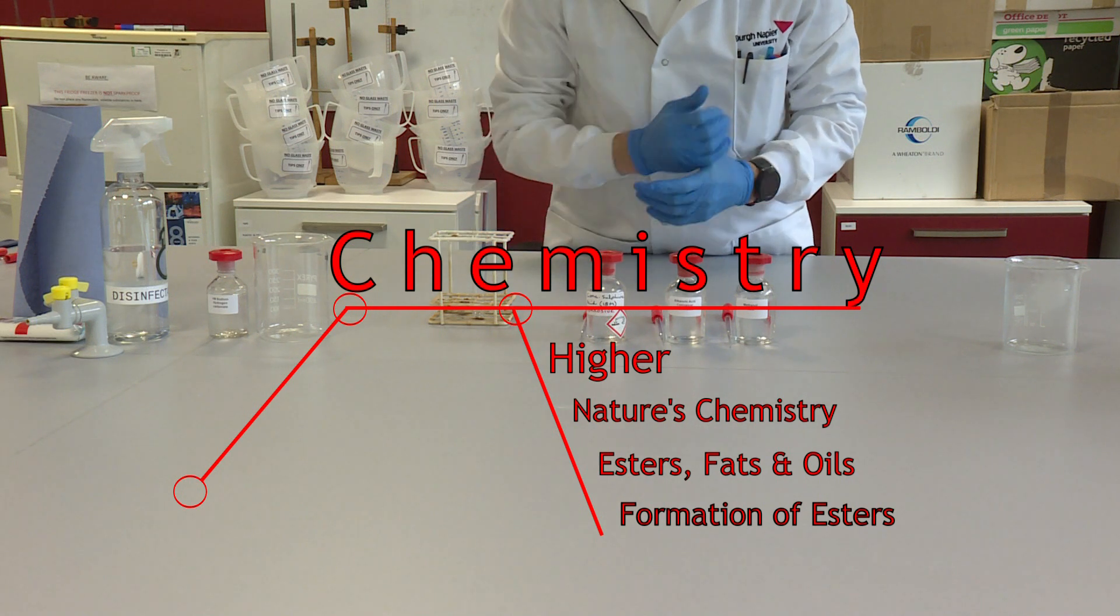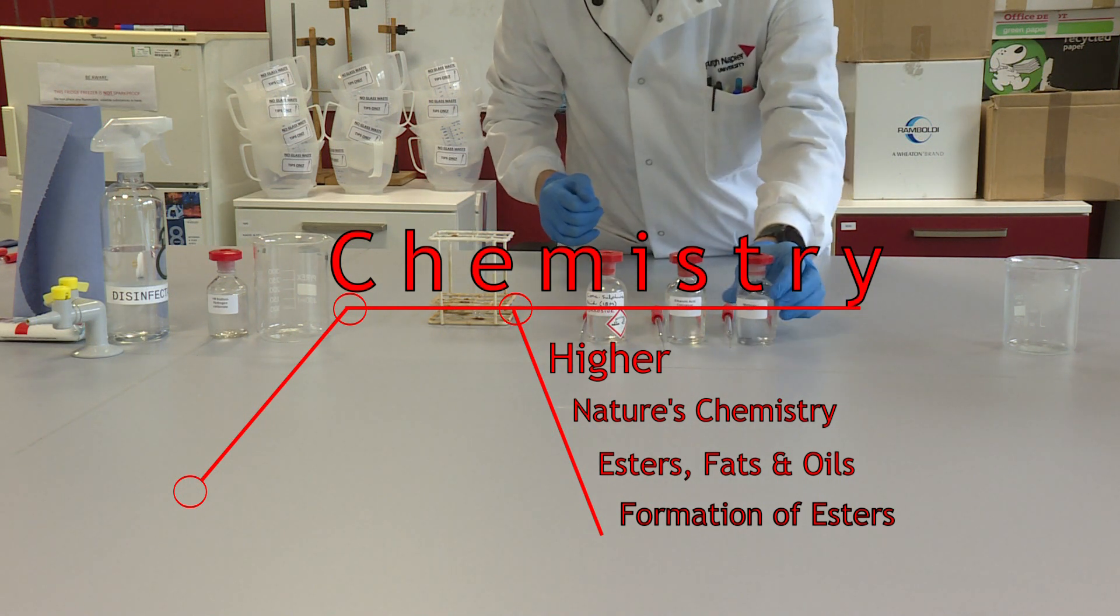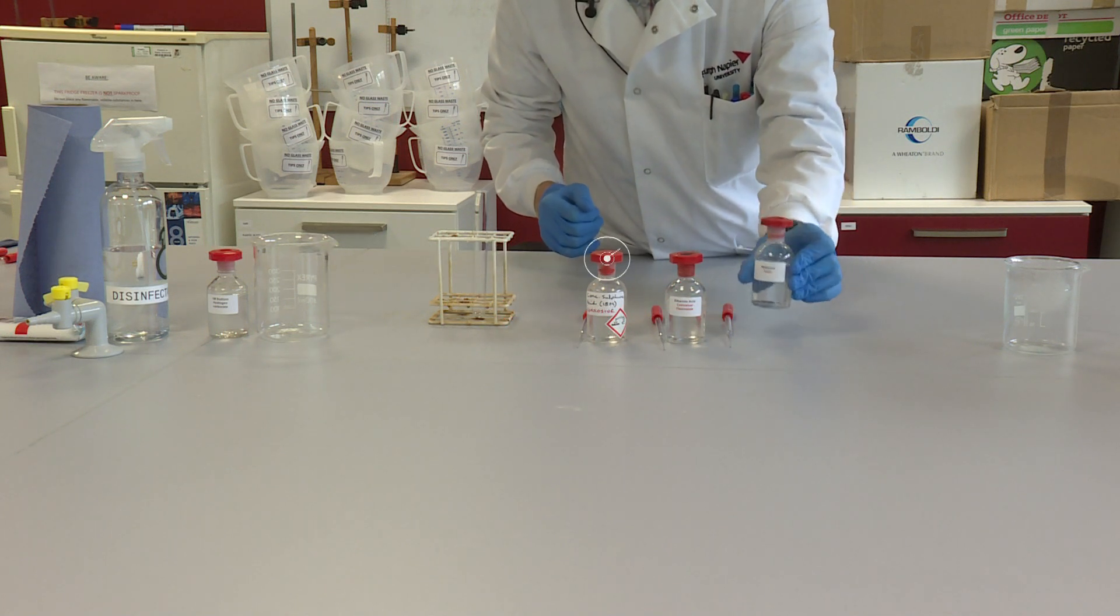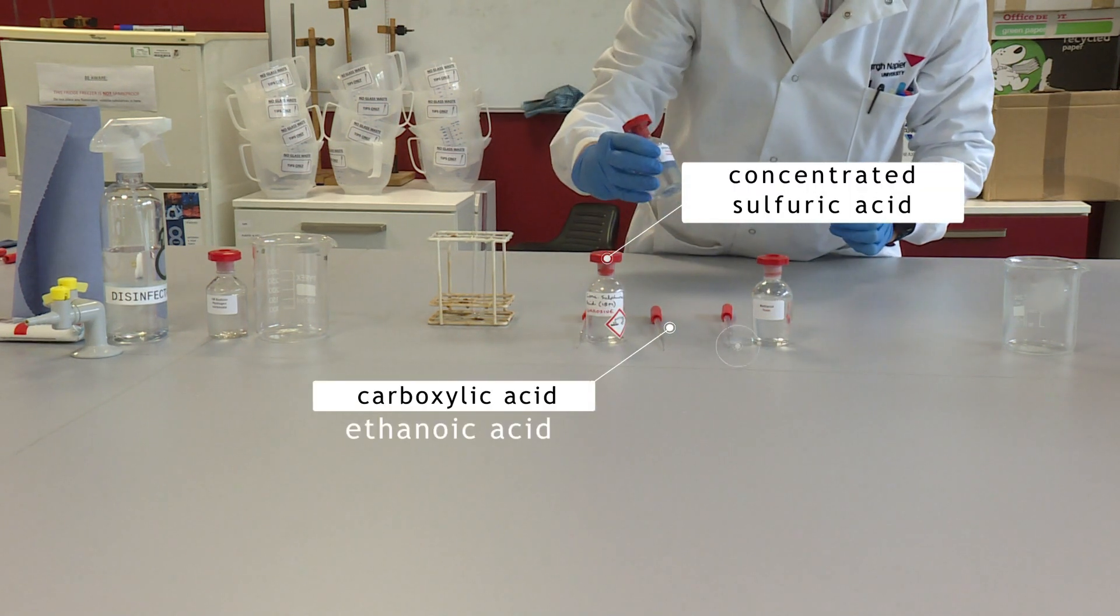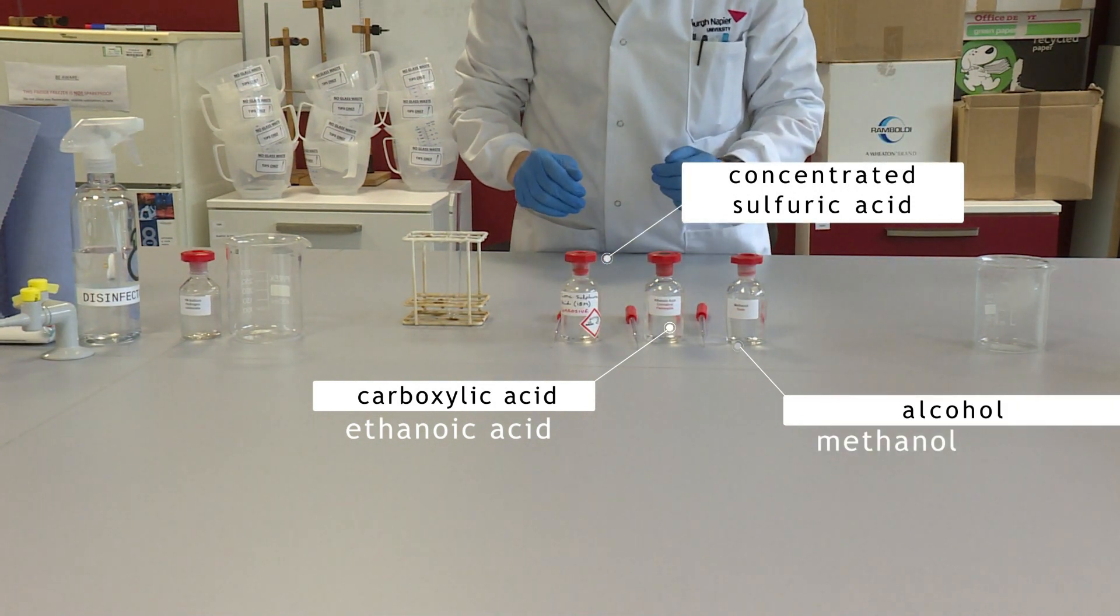In this experiment we're going to prepare an ester from an alcohol and a carboxylic acid. The alcohol we're using is methanol and the carboxylic acid is ethanoic acid. We're making an ester called methyl ethanoate.